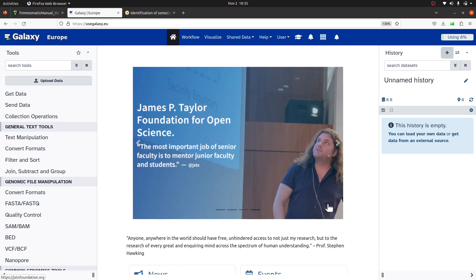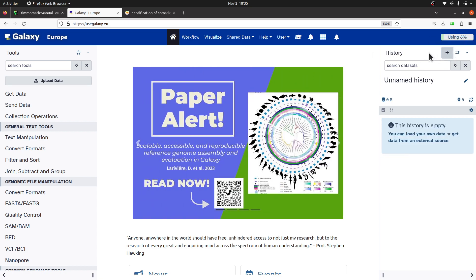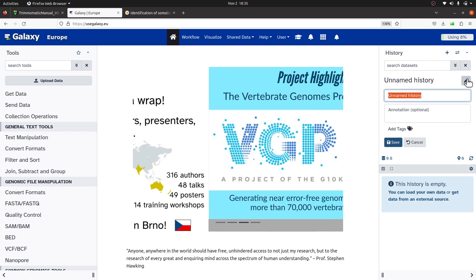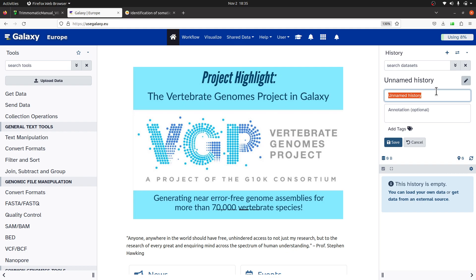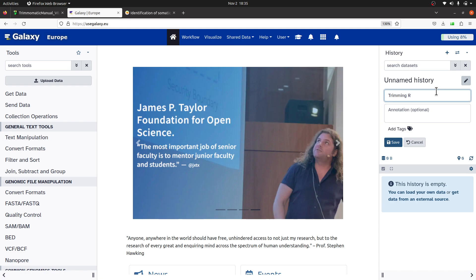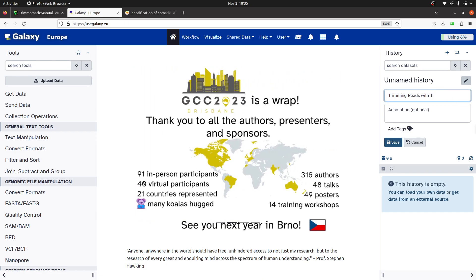Since it's going to be a new project, I advise you to first create a new history and give it an appropriate name. On the platform I'll come to this side and click the history plus button. You'll see a prompt to name the history — click edit and type an appropriate name. I'll call it 'Trimmomatic trimming tutorial'.